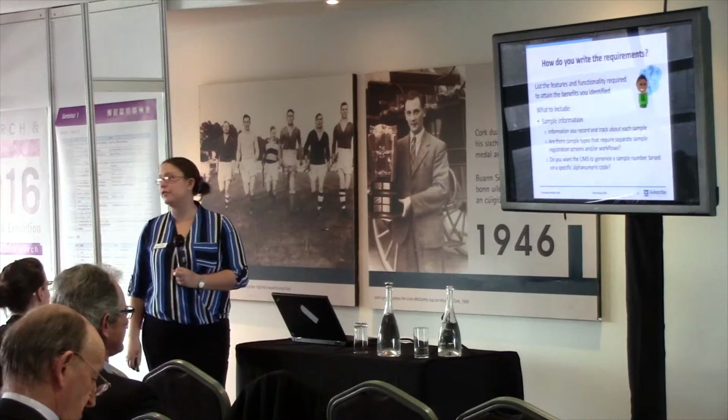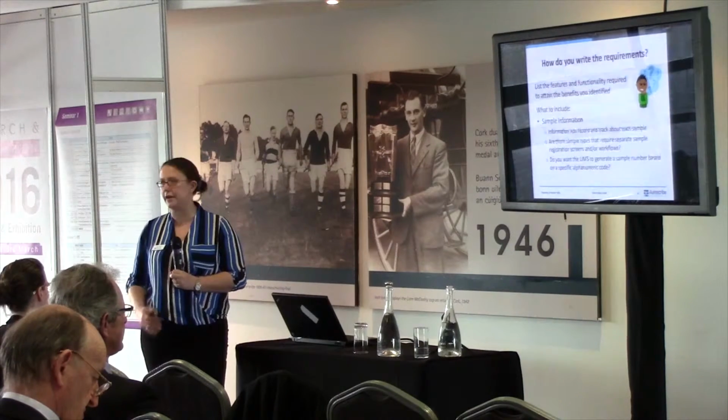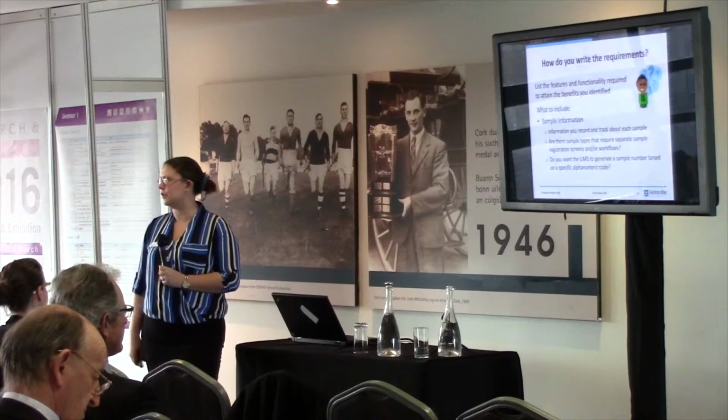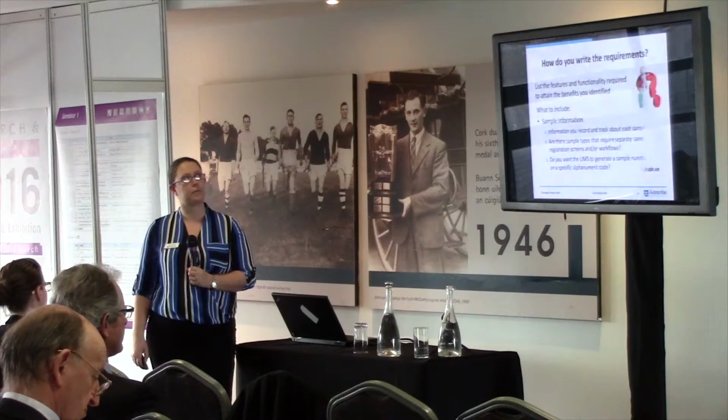Do you want your LIM system to generate a unique sample identifier? Is that going to be just an alphanumeric code? Is it going to have a completely different combination? So we need to know that kind of information.